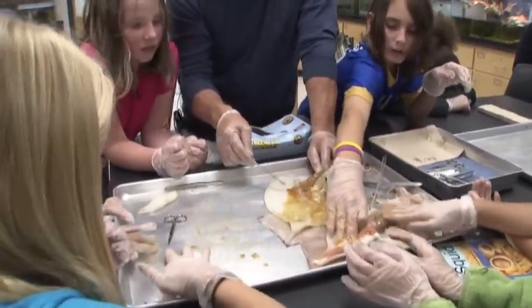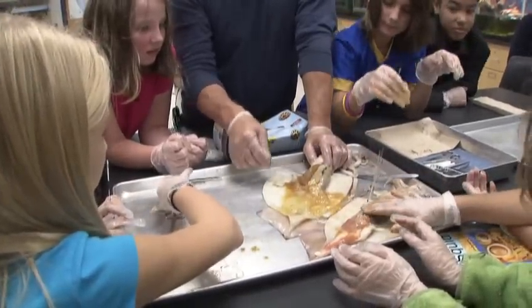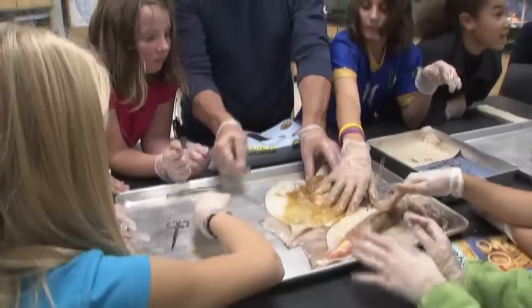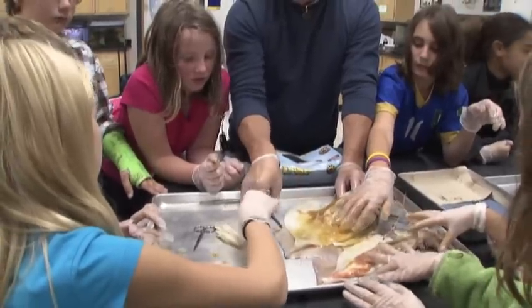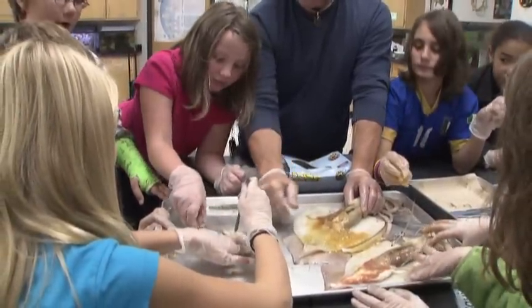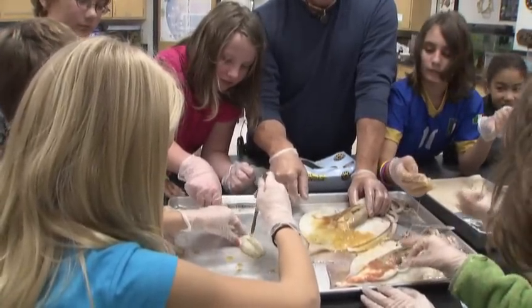We're pretty lucky. We got a male and a female, and they're soft. You guys feel them? Everyone feel them? These are soft, right? There's no vertebrate stuff. Yeah, you can cut them open. Just be careful with the scalpel. These are glands that help service the eggs that are made, give them nutrients.